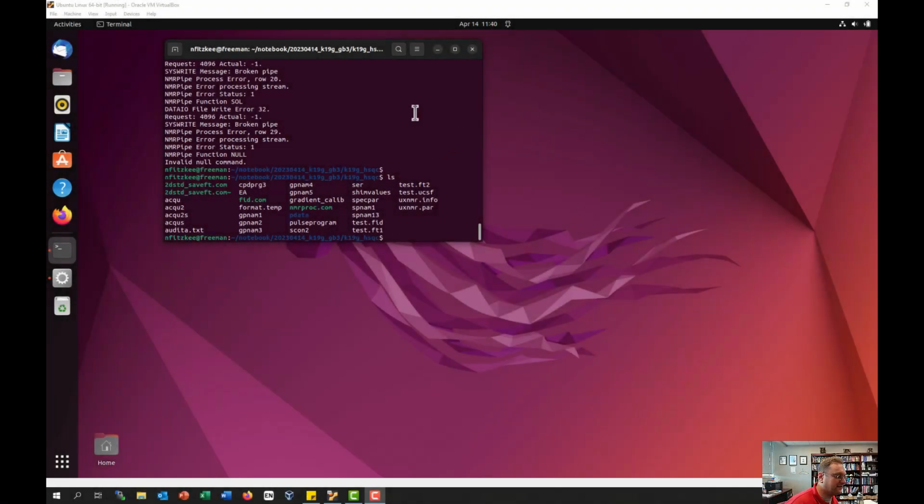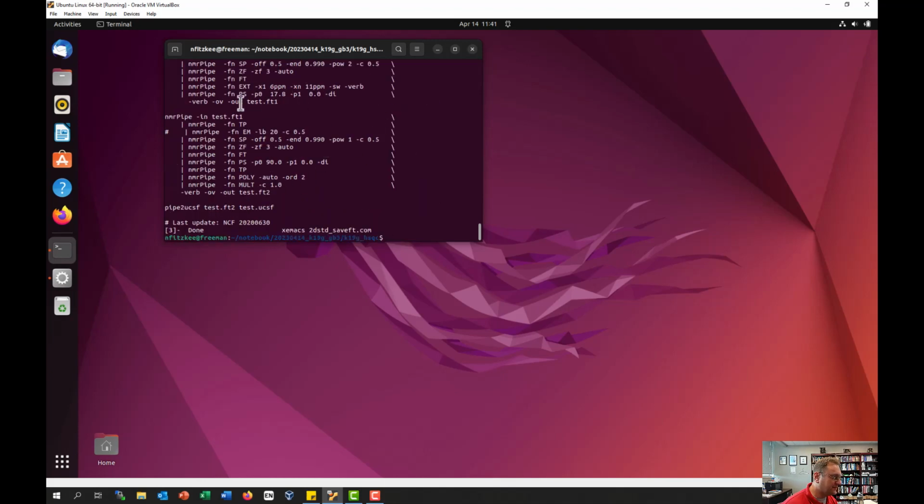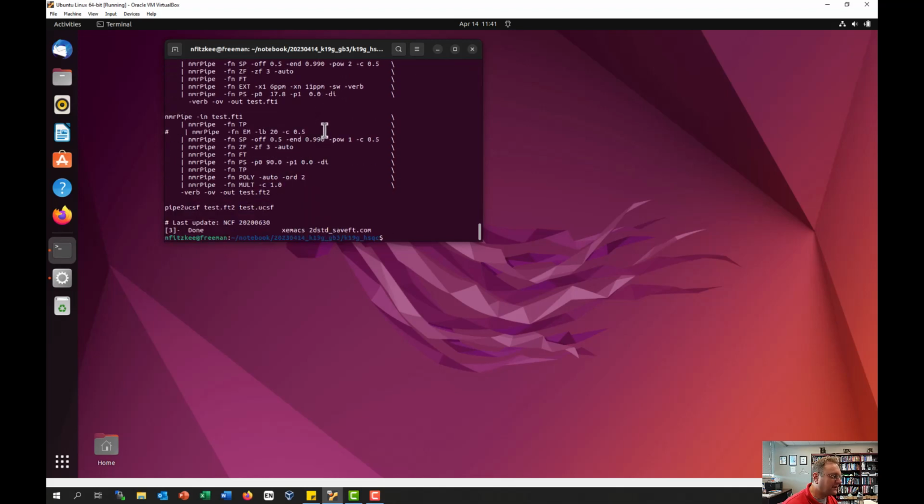Okay, in the last video we looked at how you could process things in NMR Pipe, and again the big advantage of NMR Pipe, just to keep our eyes on the main thing, is that you get this very nice documented list of all of the processing that you've done.